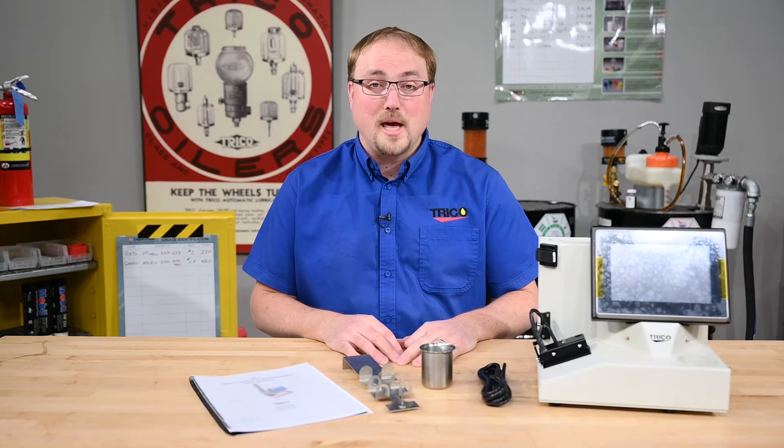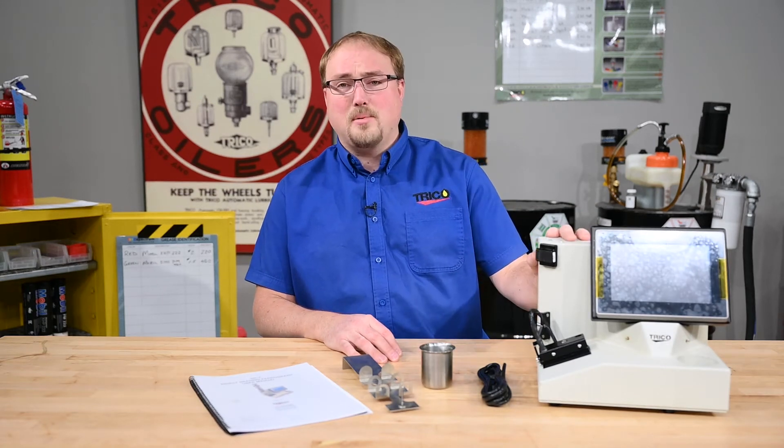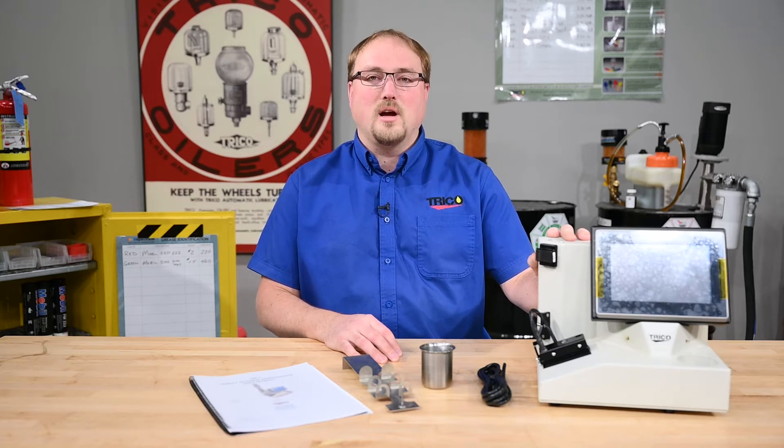Hello! Welcome back to Trico's YouTube channel. Today we're discussing the setup and operation of the Direct Reading Ferragraph, also known as the DR7.